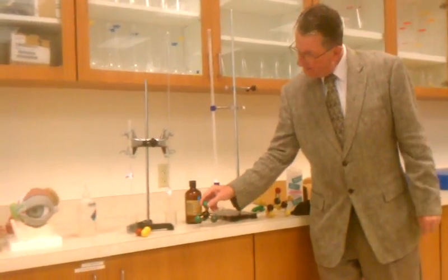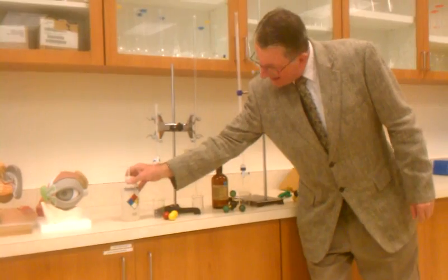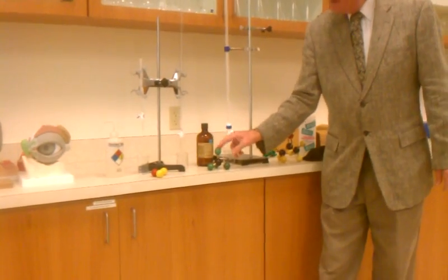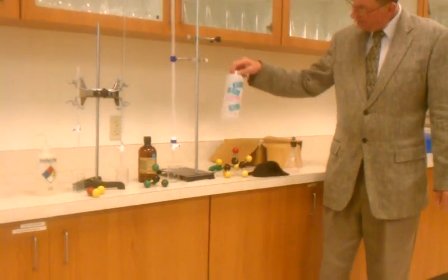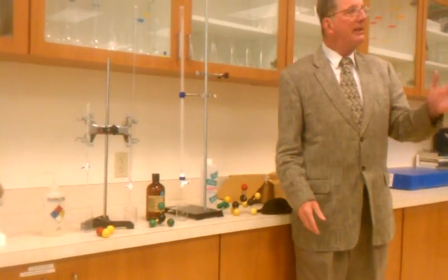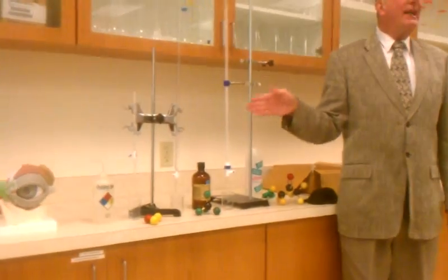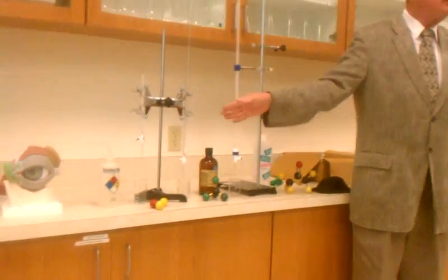So I've got all these three burettes filled with these three liquids. I've got the model of the compound sitting next to the liquid that's in that burette. This is liquid water. This is liquid carbon tet. And this is liquid acetone. Water in each of the burettes? No, I didn't say that. I just got through saying that water is in this burette. This burette has carbon tetrachloride, which is also a liquid compound, and this has liquid acetone. The three burettes are filled with three entirely different compounds, the models of which are in front of the burettes in which they are contained.